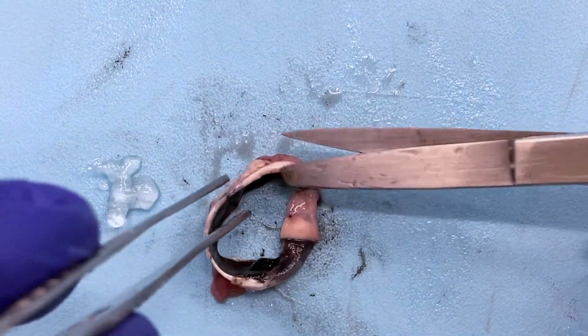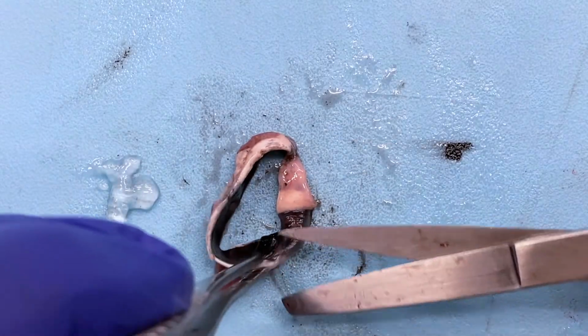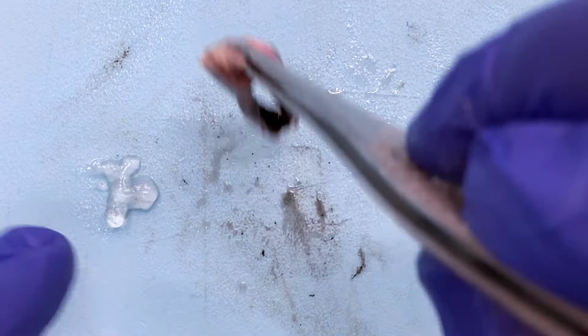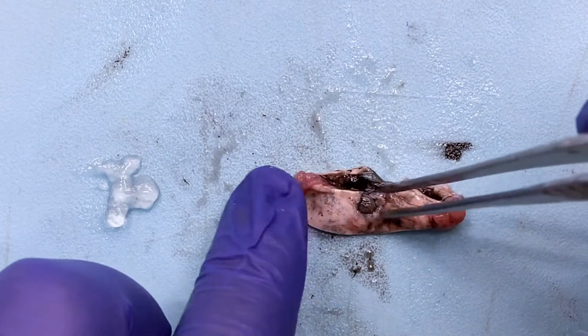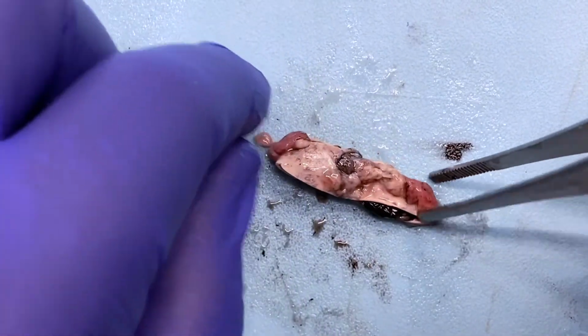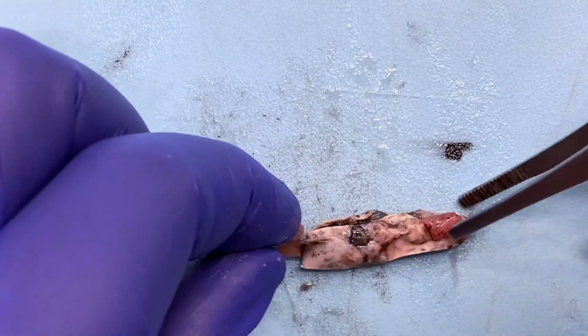Now the goal is we have to think about how histology is going to be cutting into this section, right? We want to make sure that if this is a pupil to optic nerve section, the sections they're going to take are going to show the pupil and the optic nerve in it as well. Which means, let's see if we can line this up. So there's my optic nerve.